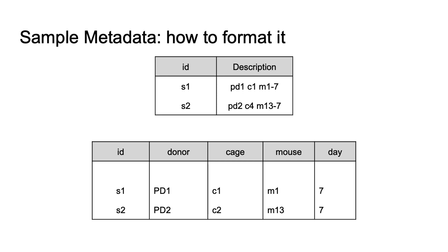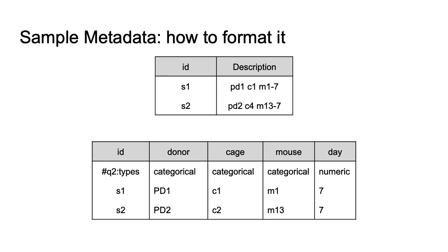So here, instead of having a description column, I've got a donor column, a cage column, an individual column, and a day column. I like to format this data as a string that's a little bit more descriptive, because then when I make my figures, I can look at it and know the answer. If this doesn't work for you for whatever reason, I recommend using the Q2 types functionality as you put together your data. You can specify whether a column is a category, even if you code it as a zero or one, or a number — and this is just useful as you think about how you format your metadata.